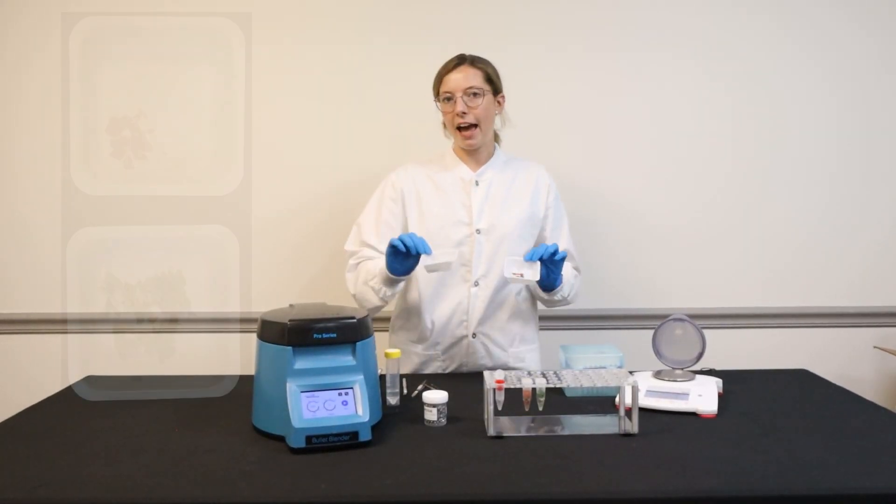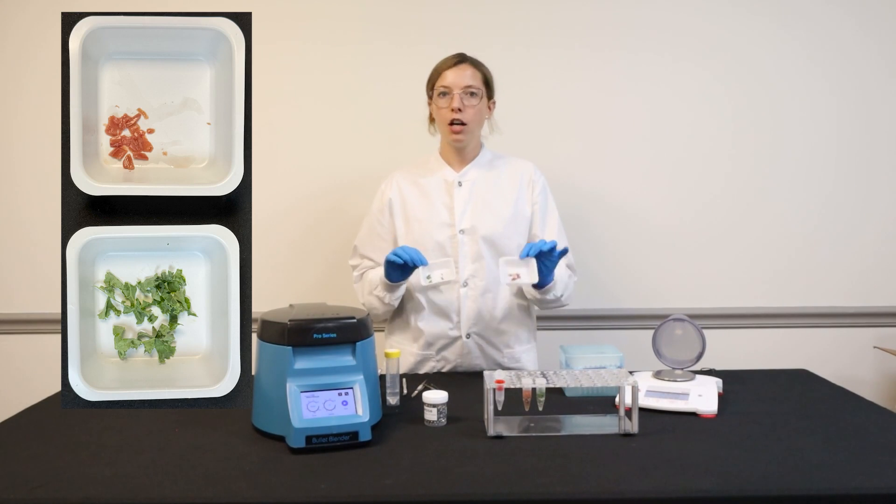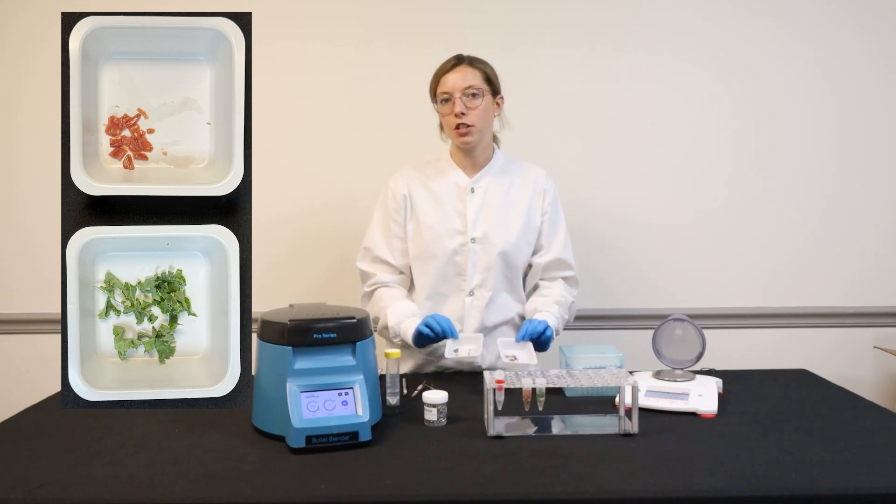Today I'm working on two different tissue types: I have kale and chicken heart. Both of these have been pre-cut into smaller pieces, which is a really important step to get that uniform homogenate.